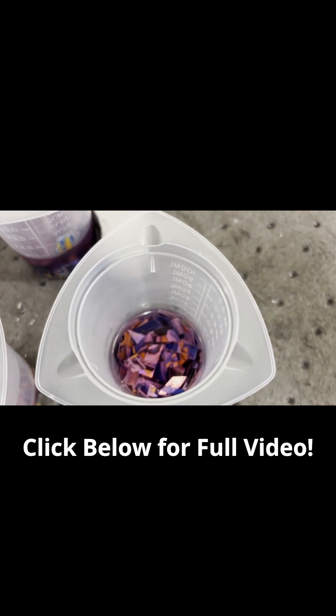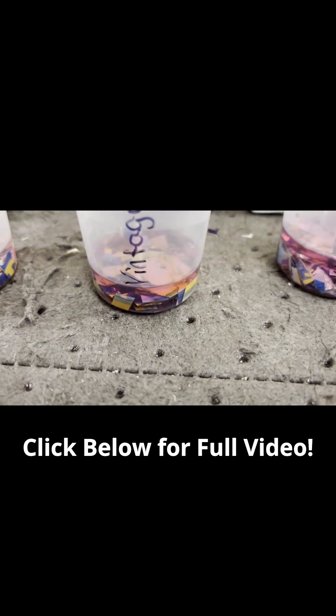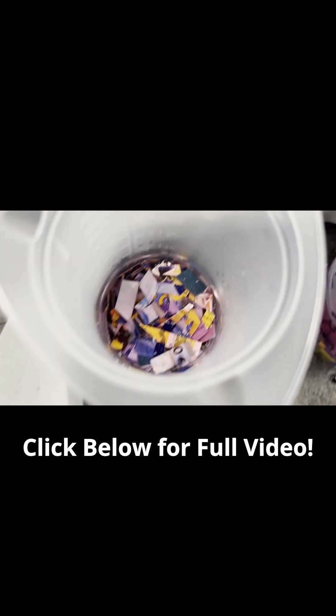And this is what things are looking like close to two hours into soaking. The differences in color are all very interesting. Not only is the U.S. solution the darkest, it is also the only one actively bubbling.